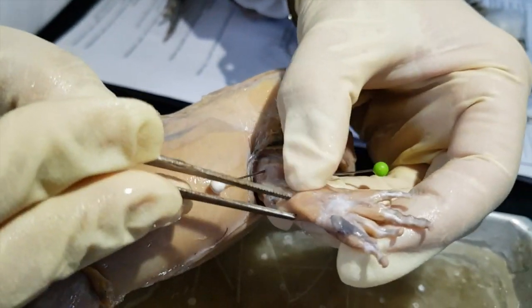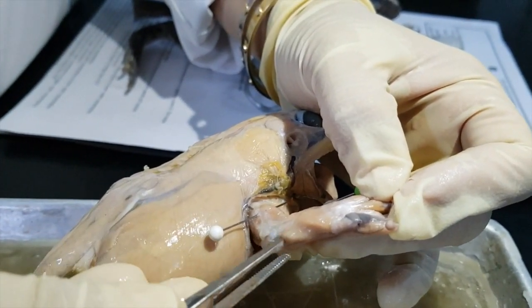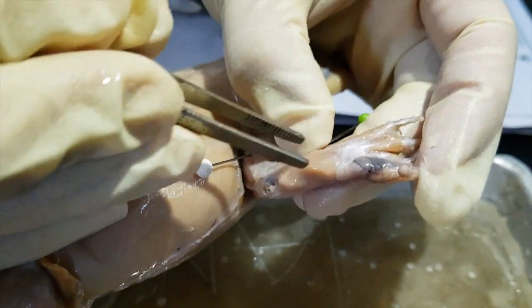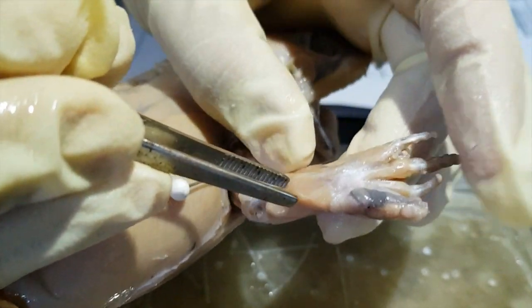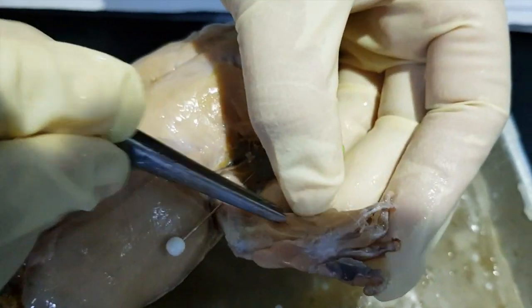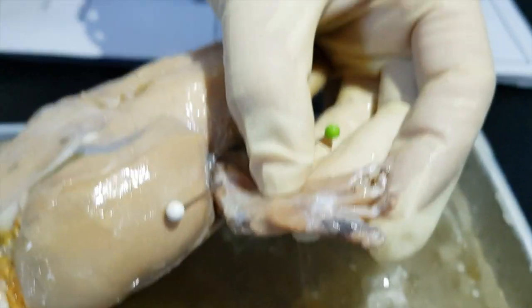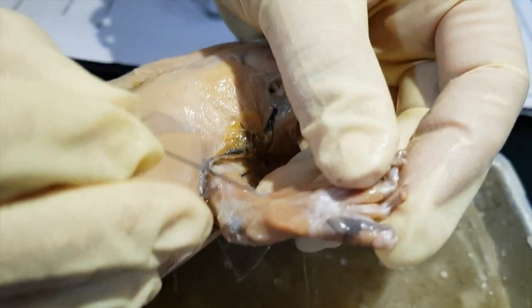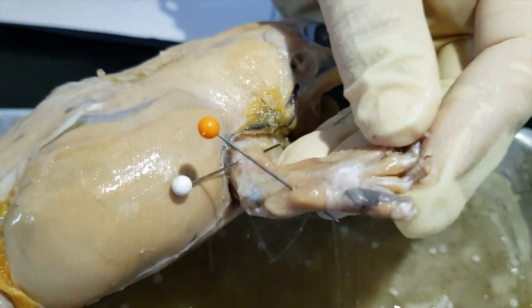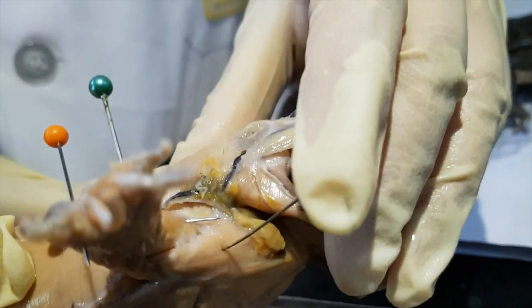Okay, so this is the ulna side. The muscle that covers the elbow is the anconeus. This muscle here on the ulna side is the extensor carpi ulnaris. And this muscle here on the radial side is the extensor digitorum communis. Extensor carpi ulnaris, extensor digitorum communis, triceps brachii, deltoid. Okay.